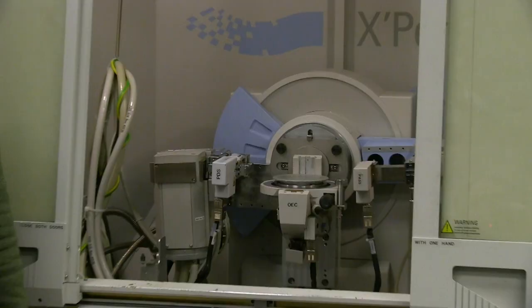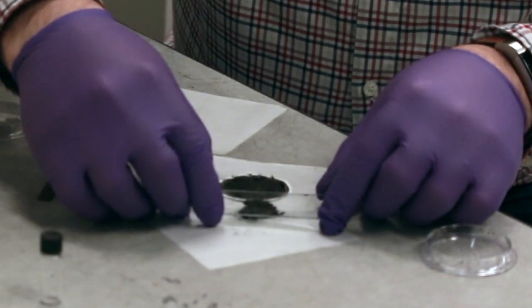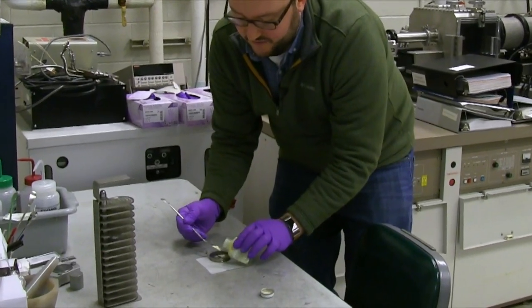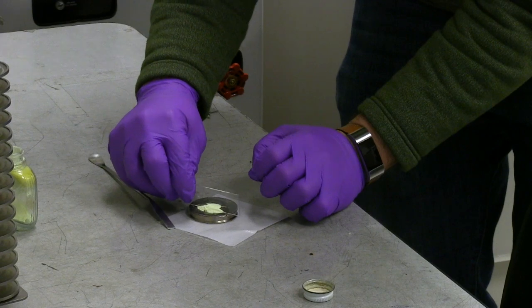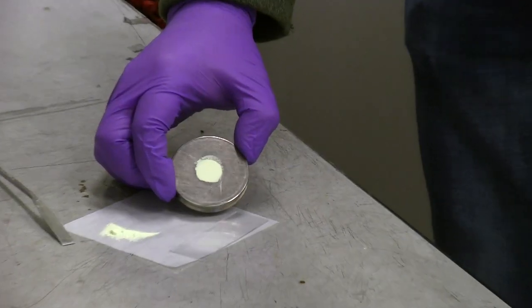A primary use of the materials research laboratory X-ray facility is powder diffraction. To prepare a powder sample, we have to put it into a cavity and make sure that the sample is as flat as possible.